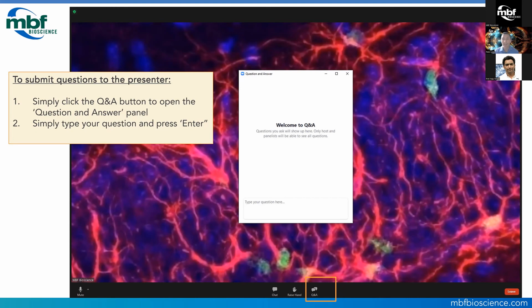Yeah, well, the working distance, of course, let's say that this Nikon objective that you have provides 8 millimeter, right? Correct, yes. So we have imaged up to 6-7 millimeter of a piece of monkey brain that was cleared. Okay, great.